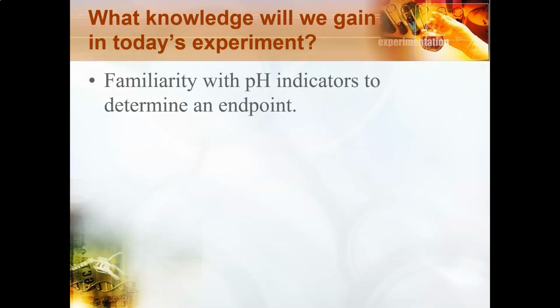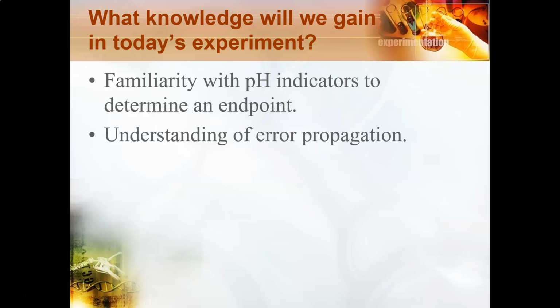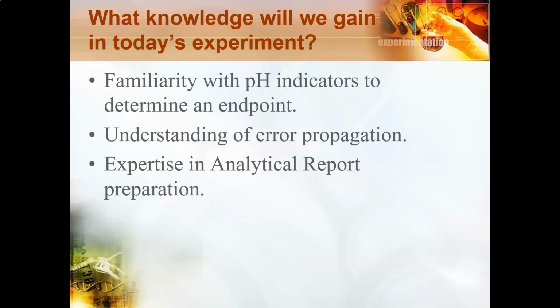So what knowledge will we gain in today's experiment? Well, we will acquire familiarity with pH indicators to determine an endpoint. We will have some understanding of error propagation, and you will gain expertise in analytical report preparation.